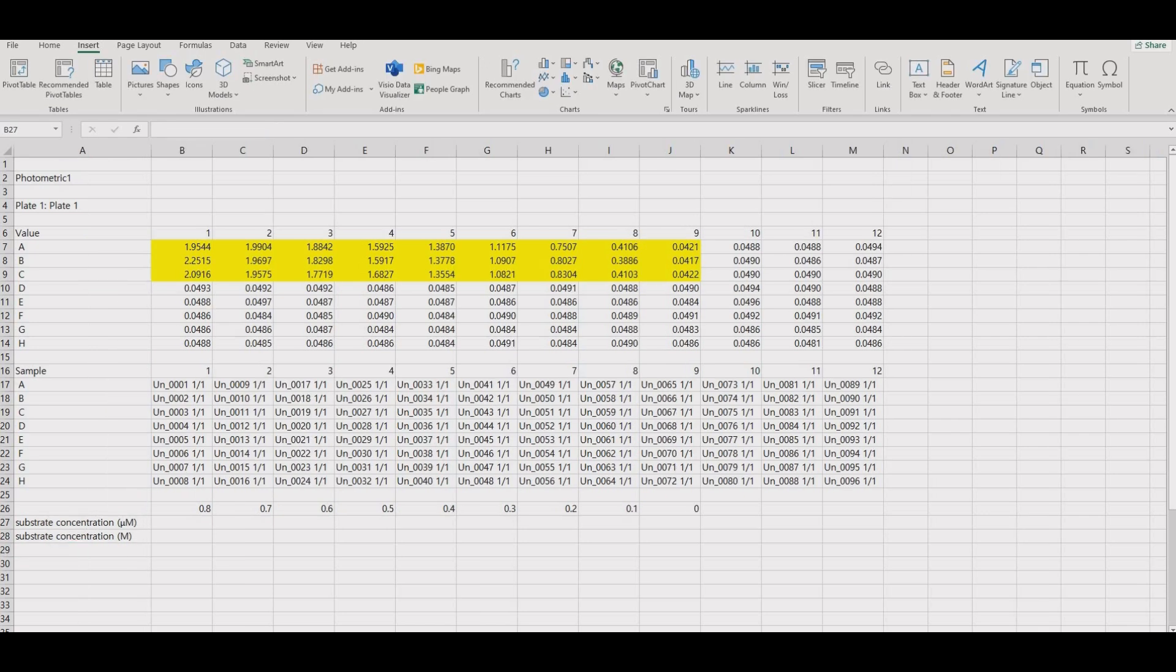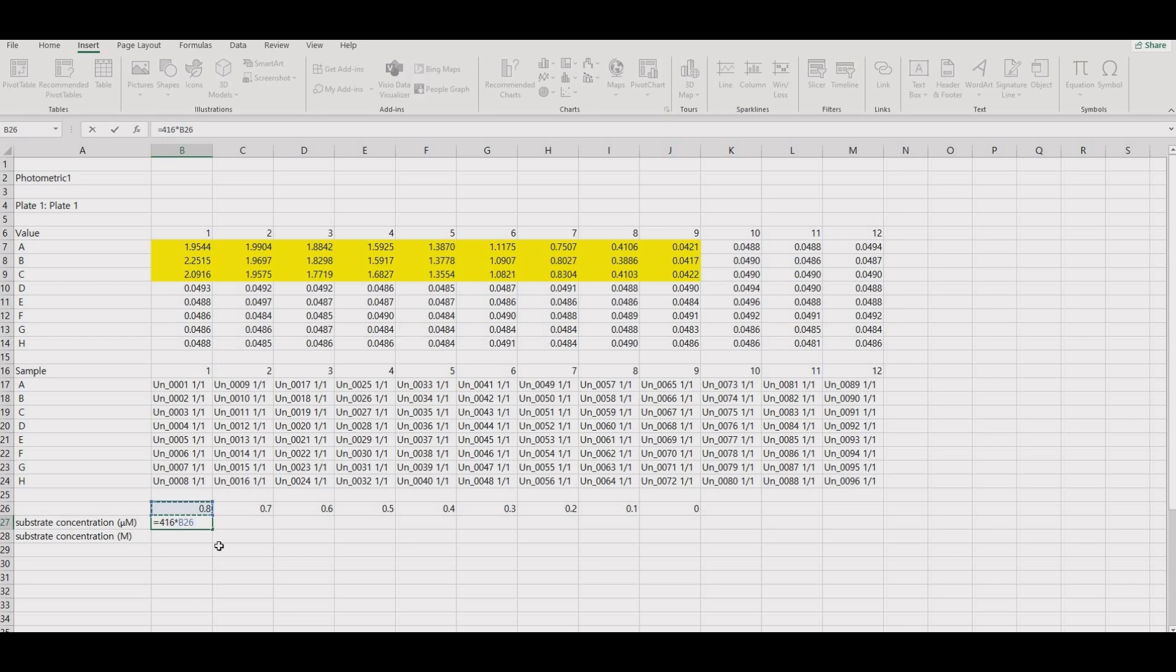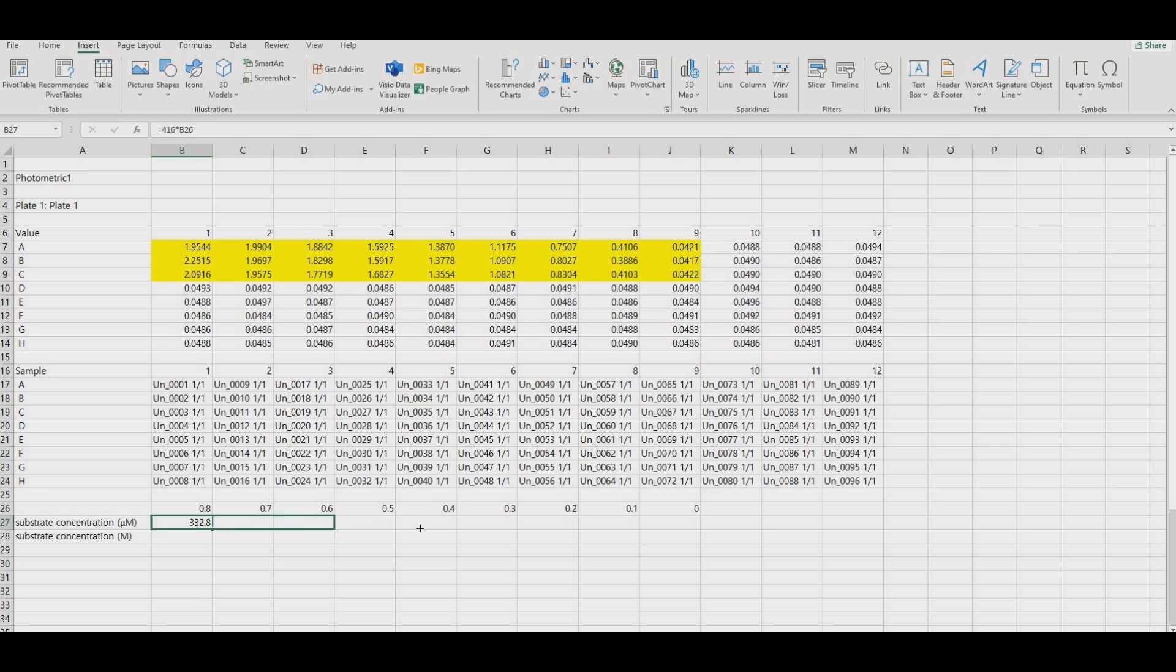The TMB stock solution is 416 micromolar, so you can use the function equals 416 star and then click the cell. Click the box, hold and drag.